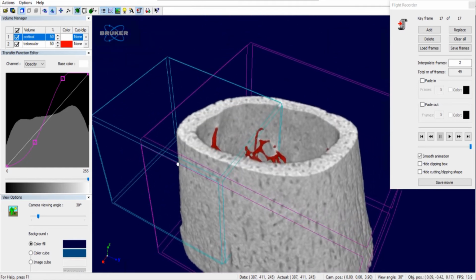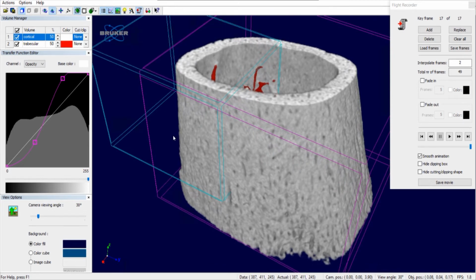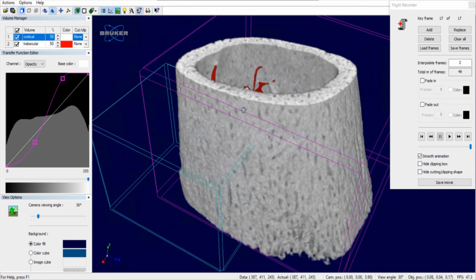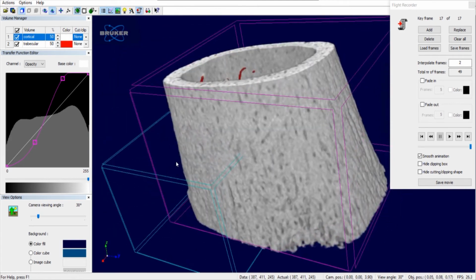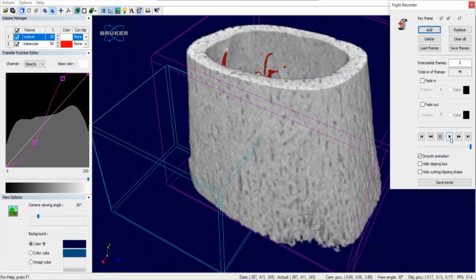And okay, let's, oops, I changed here. Probably it's going to have some movement in the video. Sorry for this. Let's start from somewhere. It is difficult to position this if I don't do like this. I have to do it. Okay, let's check where the sample stopped, and then it comes back to the same position.